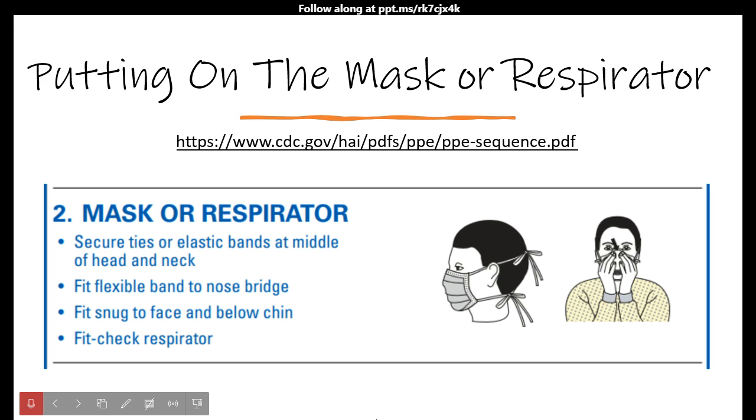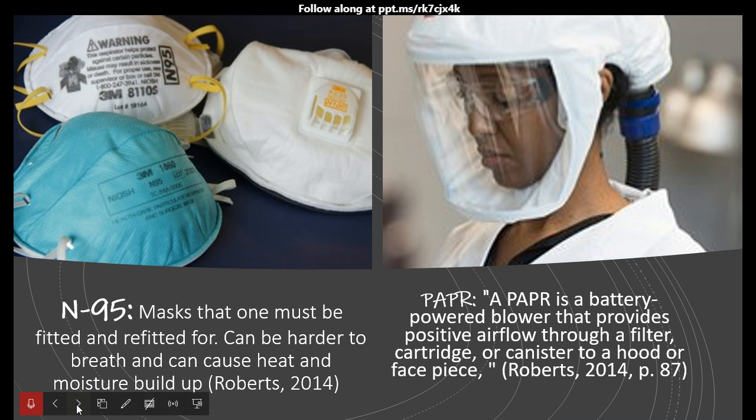And you want to make sure that you've been fit tested if it's an N95, or that you know how to use the PAPR. We're going to look at the difference between the two. The N95 is on the left. It's a mask that must be fit tested. So if you have changed in your weight, had facial hair, things like that, you're going to have to be refitted. And every year you should be refitted.